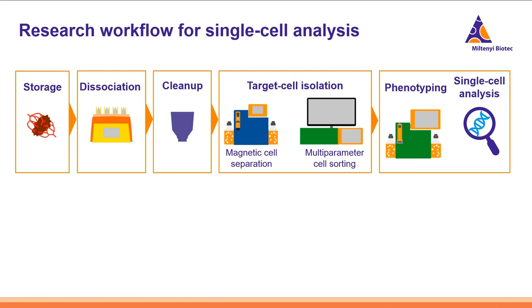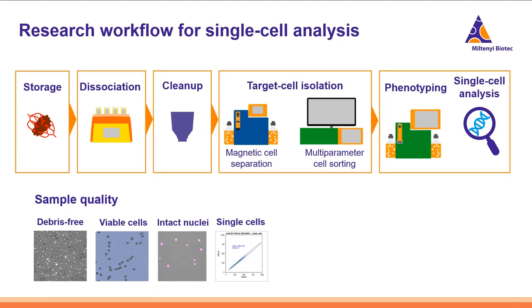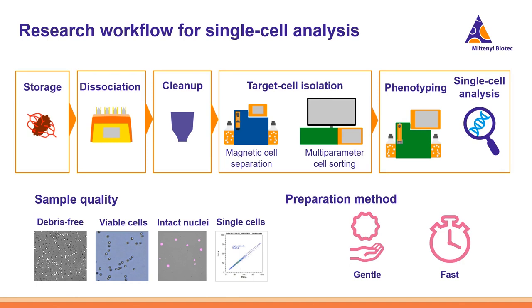But in all of the cases, what you need is a very good sample quality, so a debris-free sample with many viable cells. And if your only study is nuclei, we will need intact nuclei, and also we need to obtain single cells and not clumps. So we need a preparation method that can be gentle and fast at the same time.